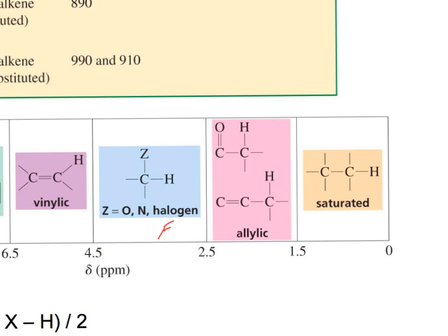Now this is additive. The one molecule we have has both a fluorine and an oxygen pulling on it. So where would we expect it to be? I don't know, maybe 6. We're just guessing here. Because it has both a fluorine and an oxygen pulling on it, it's going to be pretty deshielded, so maybe we'll guess it's around 6. What would HB be at? That had just the oxygen pulling on it, so we'd expect around 3.5, the middle spot here. Let's see, what does HC look like? Is it near any pi bonds or any electronegative atoms? Nope. It's probably down in the saturated region, so let's just say 1.